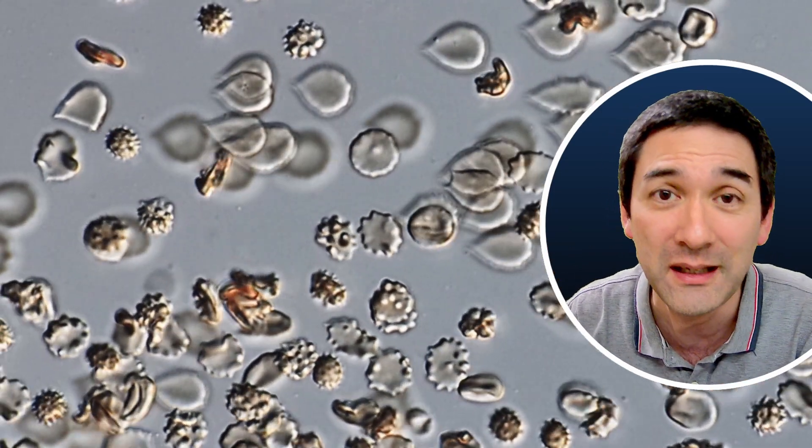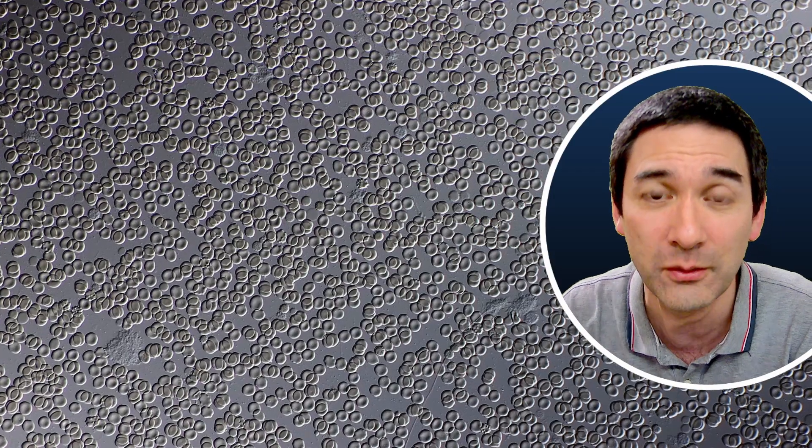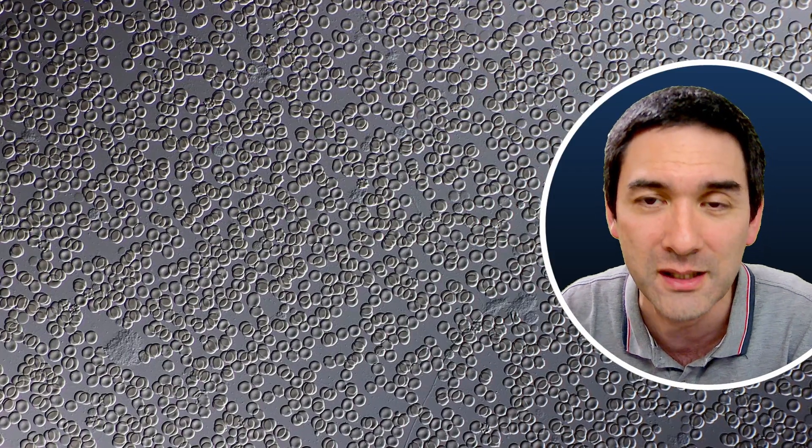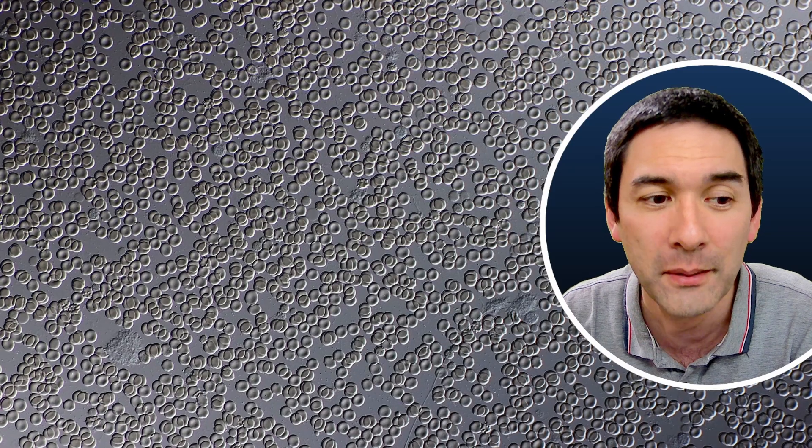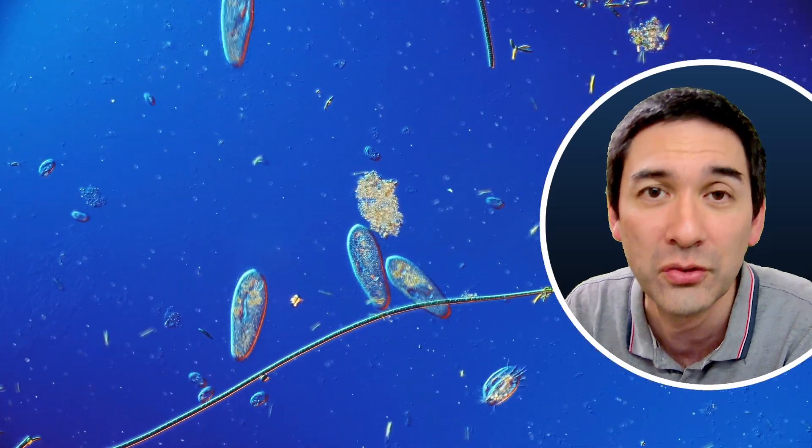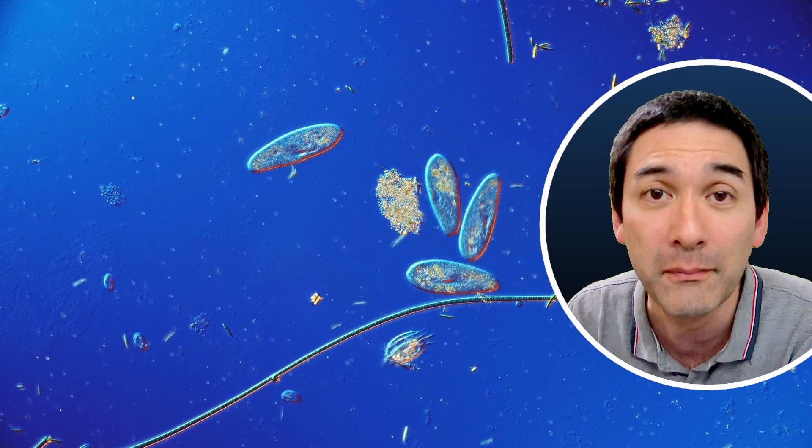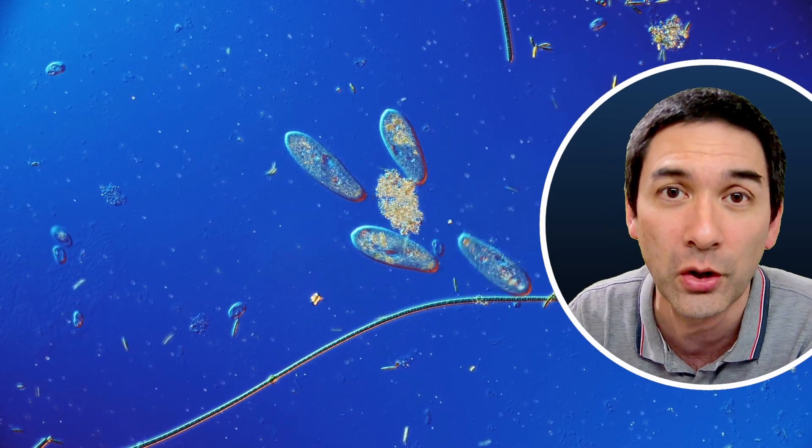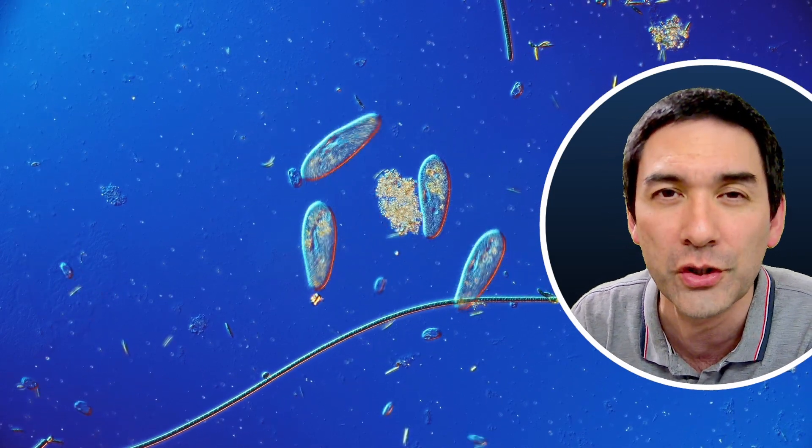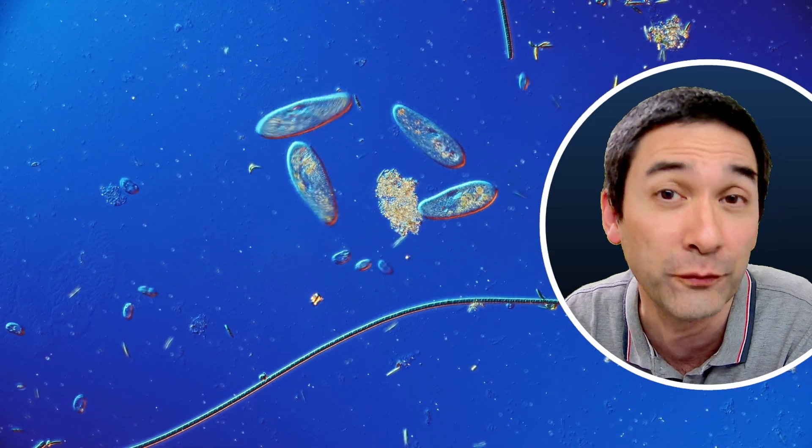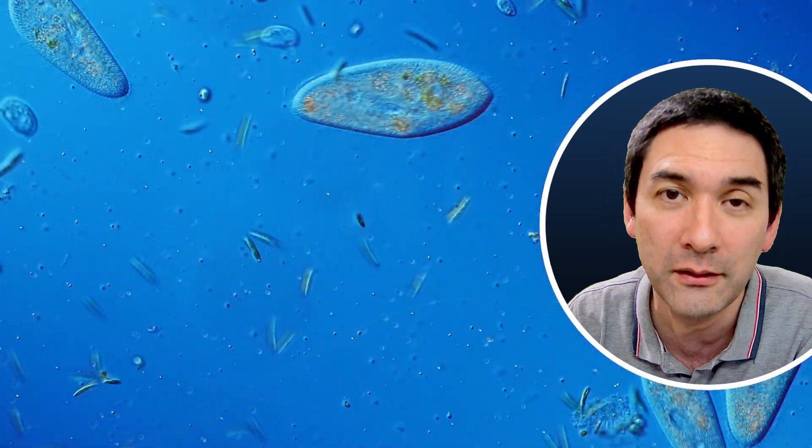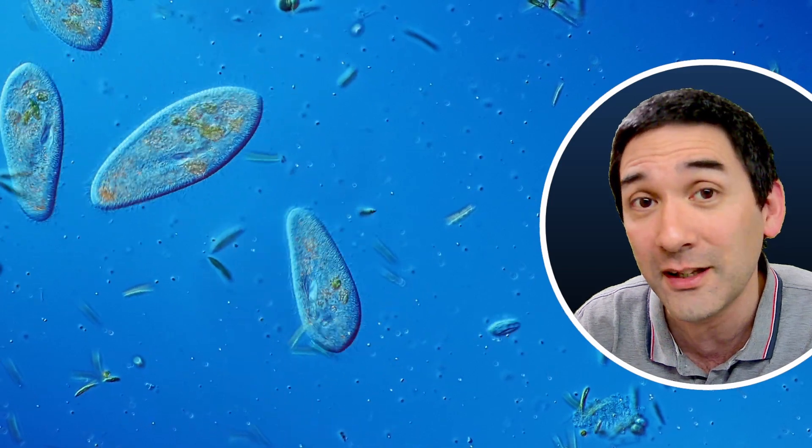And of course, the same thing can also be done with other cells. Here again, you see the nice red blood cells is still intact. But of course, the same thing can also be done to those little paramecia. These are single-celled microbes, protists. They are actually fairly large and they swim around. They're freshwater organisms. And freshwater means that they don't like salt.